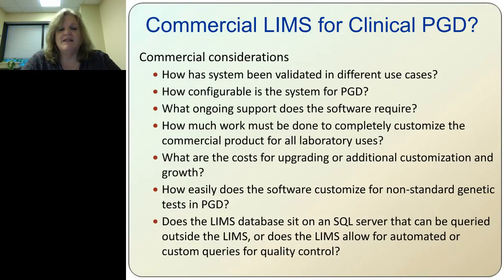And ultimately, does the LIMS database allow transparency? So even though the LIMS software is sitting on top of a database, are you able to access that database cleanly from external tools to actually do due diligence on the database or other types of analysis that you don't need to go through the LIMS system to do? So doing third-party checks or database integrity checks, do you need to go through the LIMS to do that? Maybe sometimes the LIMS has things built in that you're able to do independently. I mean, it's built into the LIMS system itself. So these are the kinds of questions you should consider.